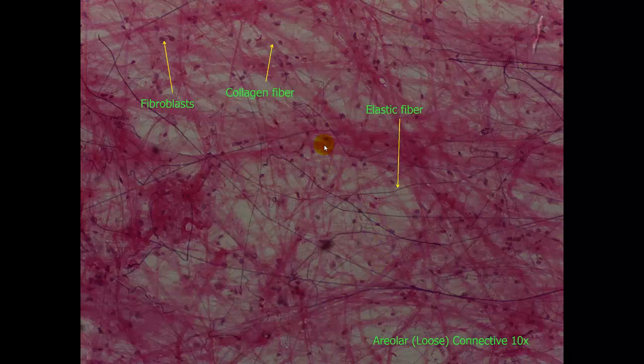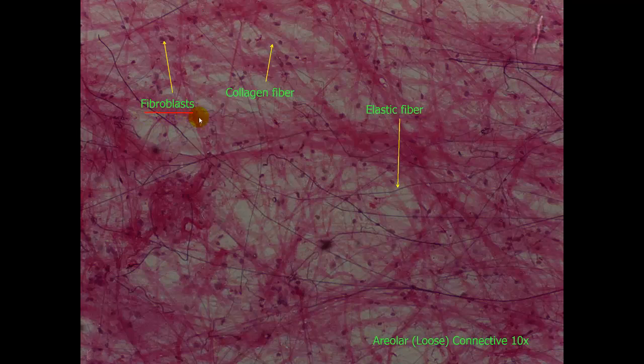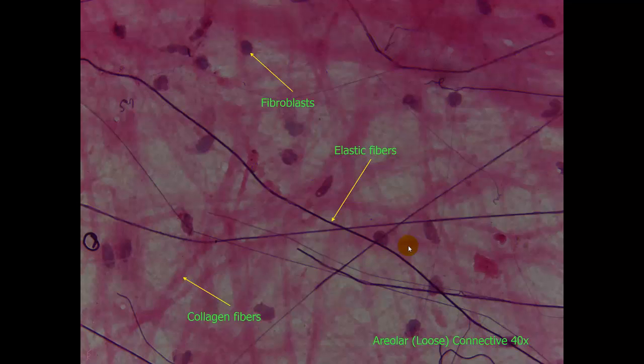As you are looking at the tissue, you can see the fibroblasts. These are cells that are making the fibers. We have the more dull reddish color fibers. They are wider. Those are the collagen fibers. And then you have the thin, darker stained fibers. Those are the elastic fibers. Now there are also generally reticular fibers contained, though they are not easily apparent in these views. One closer look clearly shows the collagen fibers, the elastic fibers, and the fibroblasts.